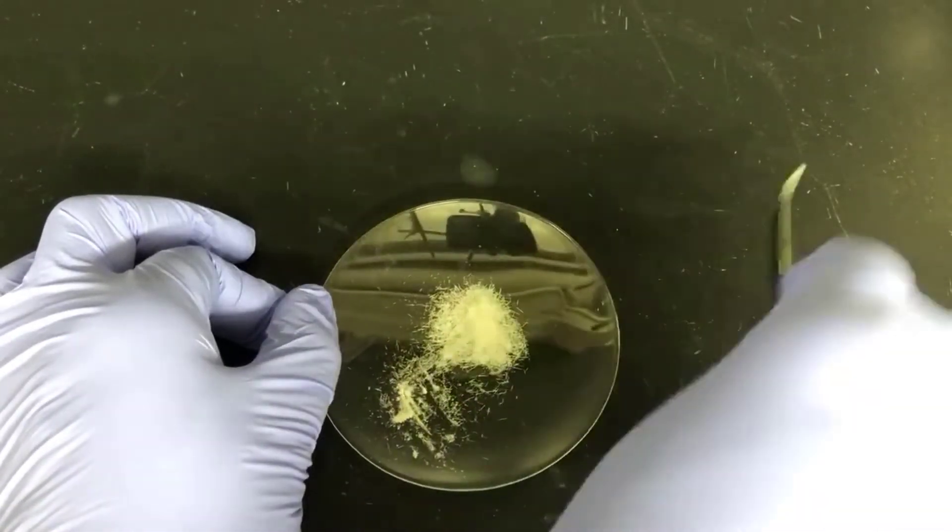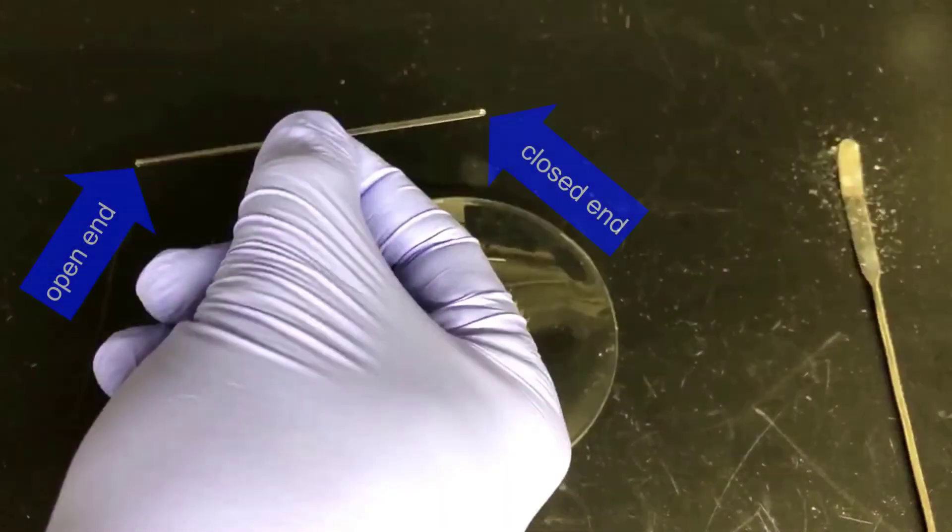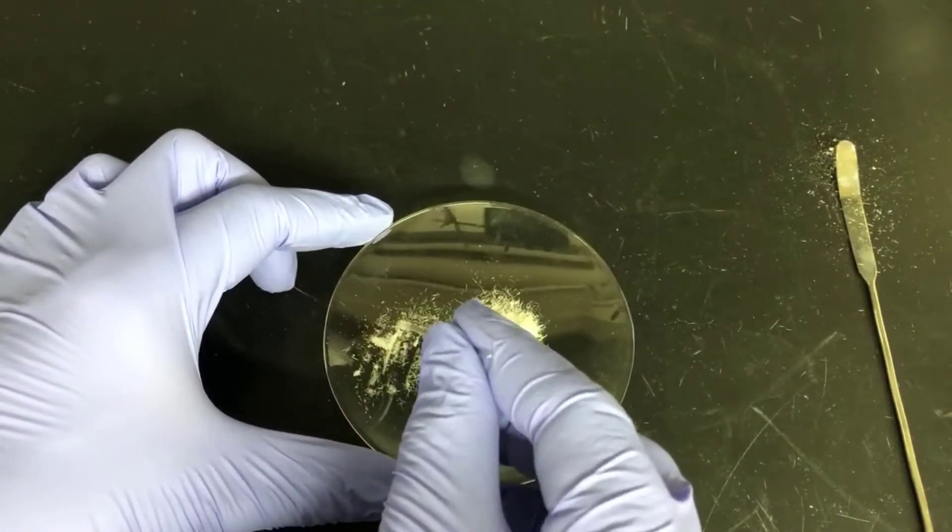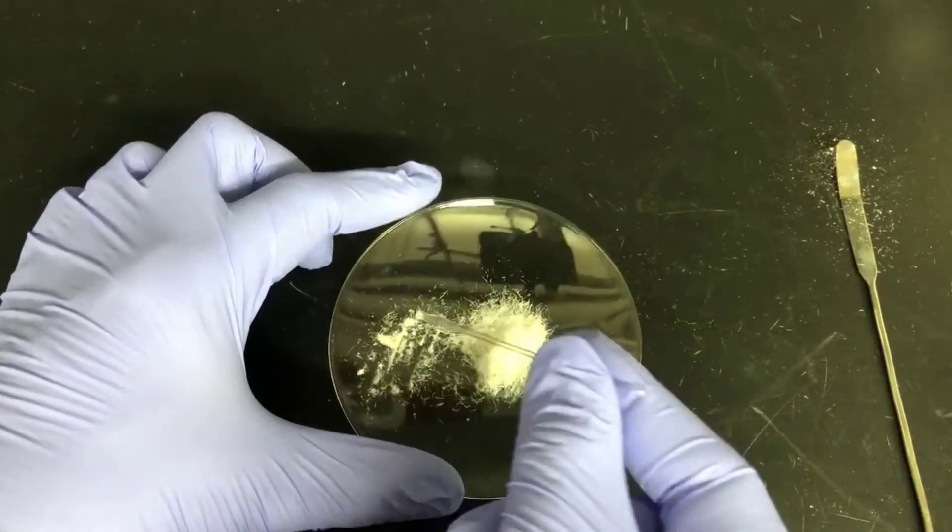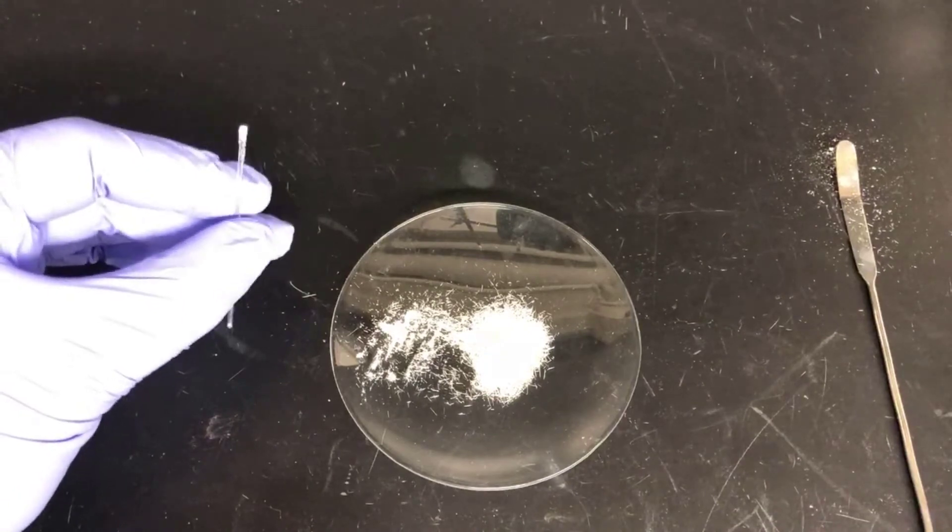Once the crystals are powderized, I'll take a melting point capillary, which is a tube that's open at one end, and jam the open end into the powder that I just made. This will force some of the powder into the capillary tube. Then I can tip it right side up and tap it on the bench to force the powder down into the end of the tube.